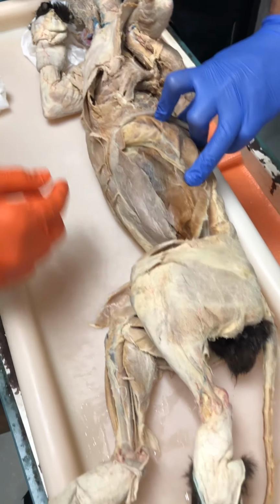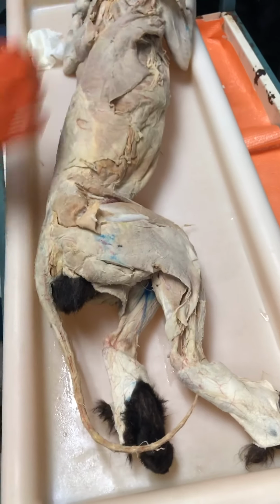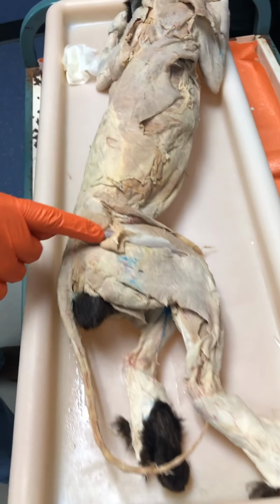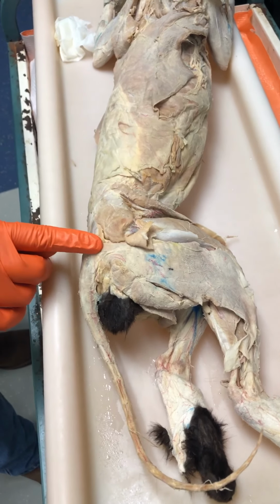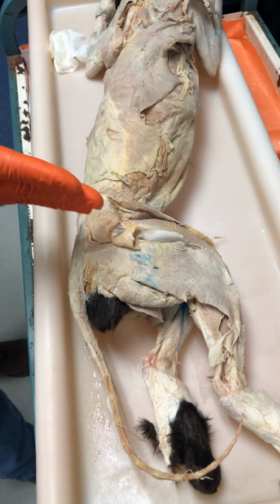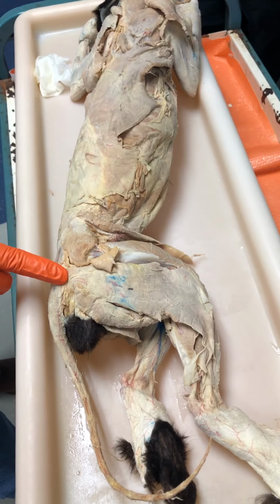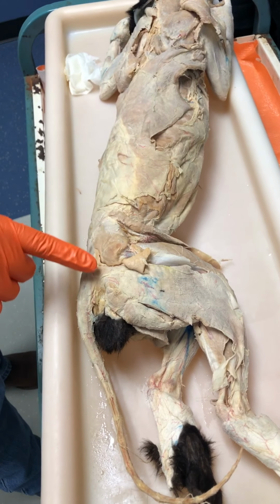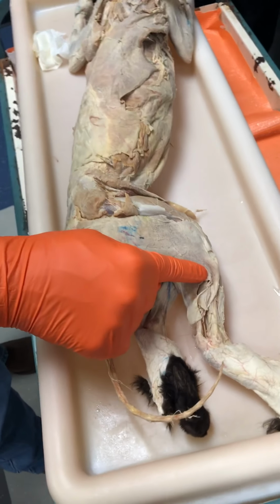Okay. So then getting down into the legs, we'll flip over on this side because it's dissected. You can see this large triangular muscle here, that's the gluteus medius. Then you can see this thin one here, that's the gluteus maximus. So they're big and smaller in the cat because the cat's leg walks like this. But in humans, the medius would be smaller than the maximus. So gluteus medius, gluteus maximus, and then this large one here is the biceps femoris.